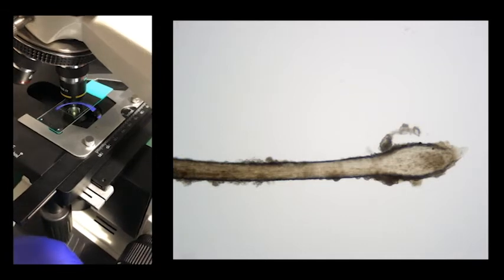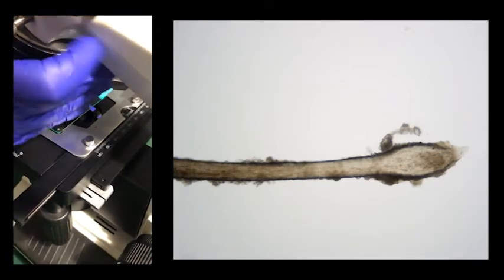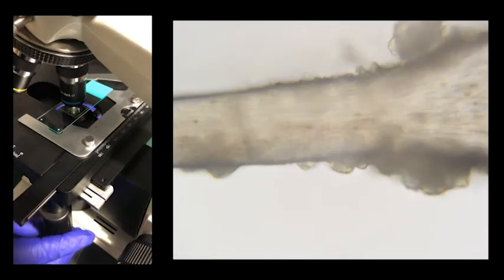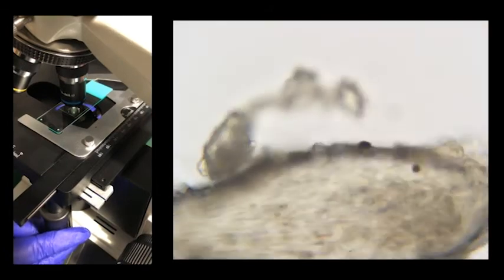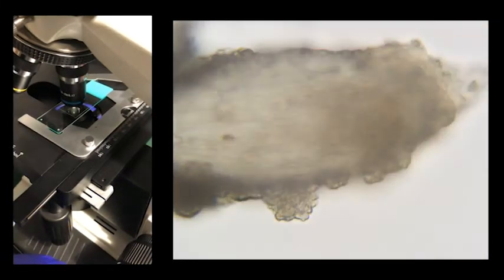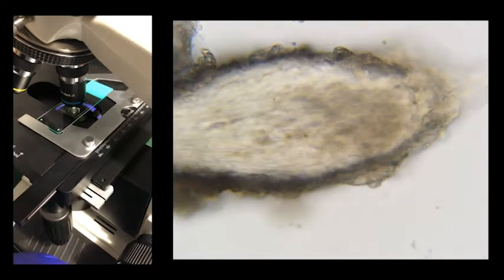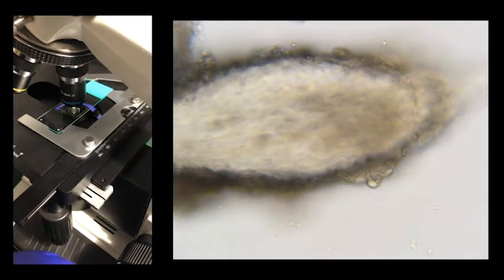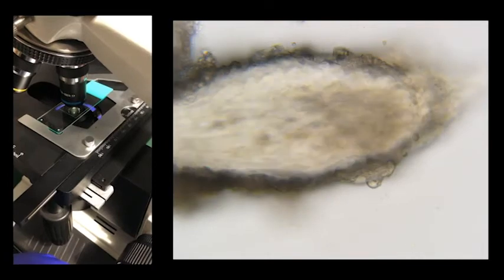And to get an even better look, you can turn it up to the highest magnification. Center your object a little bit—I want to get a look at that root. That root looks really cool. Sometimes it takes just playing with the knobs a little to get where you want it to go.